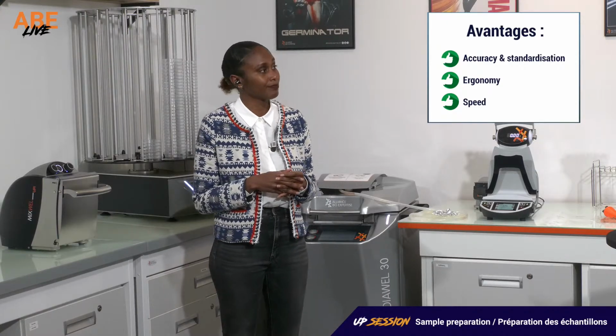Okay. And so once the sample has been diluted, what happens after? After the sample has been diluted, you need to go through a step of homogenization, as we said. It's important to blend the sample, because if you don't do this step, then the microorganism you are looking for might not be found within your sample for the step afterward. So if you want to have reliable results, you need to go through this step.